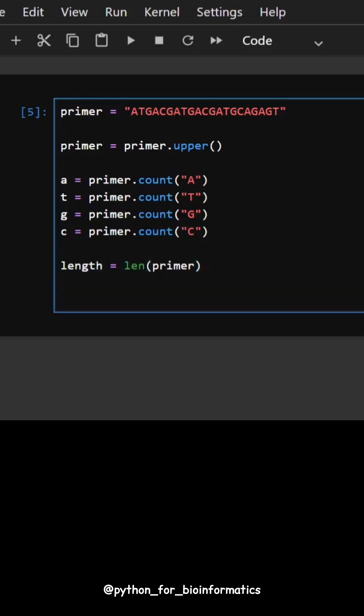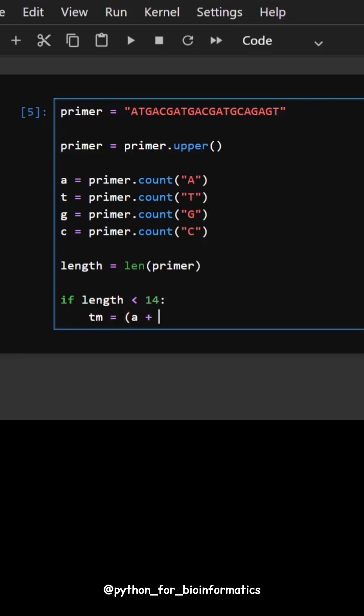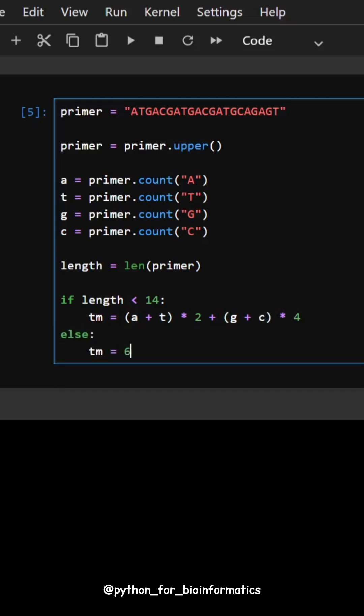Then we check the primer length. If it's shorter than 14 nucleotides, we use the simple formula 2 times A plus T and 4 times G plus C. If it's longer, we use a more accurate formula that includes the GC content and the primer length.